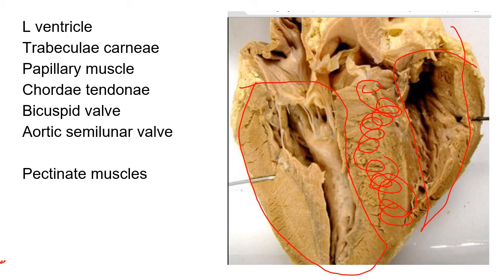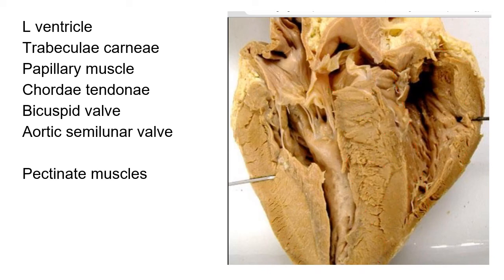So again, how do we know which ventricles we're staring at? Recall, the trick is always, inside of a heart, be it a real heart or a model, the thickness of the myocardium. So here's some myocardium for you over on this side, but here's myocardium on this side. And you can see that this side I'm coloring on right now, the myocardium is way more thick. So that means that this is the left ventricle.